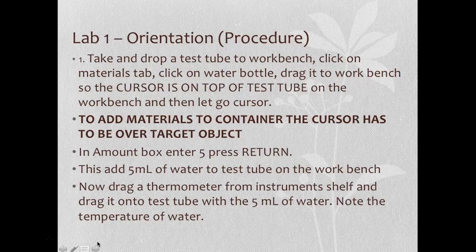So when you are adding things to, say, a test tube or any kind of glassware, beaker, etc., make sure to drag that container or the chemical to the workbench and place that cursor right on top of that object into which you're pouring the liquid or the chemical, okay?